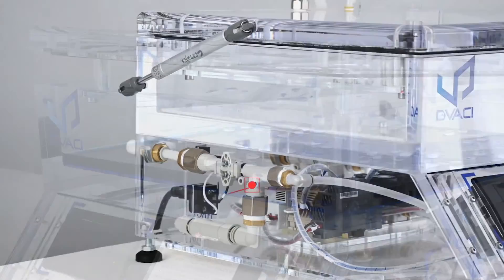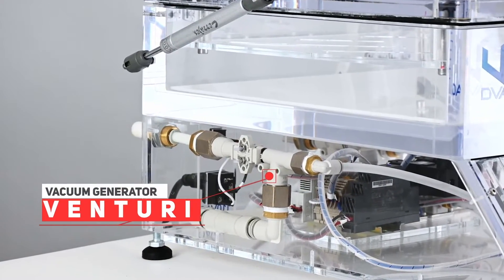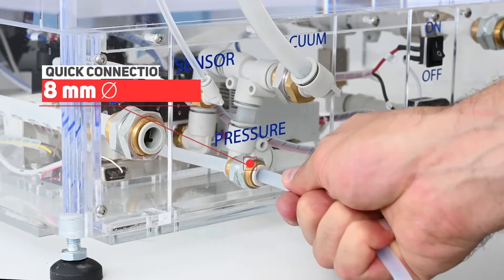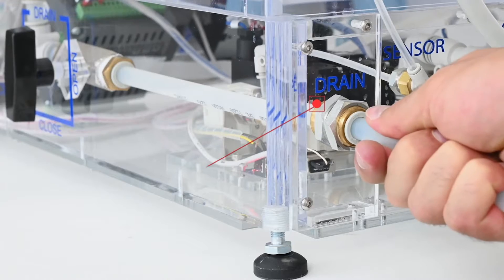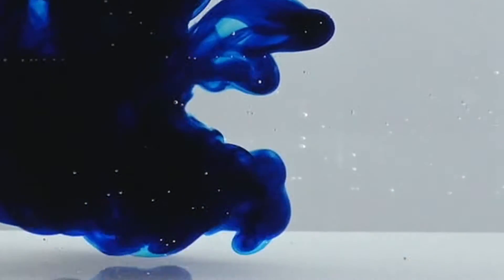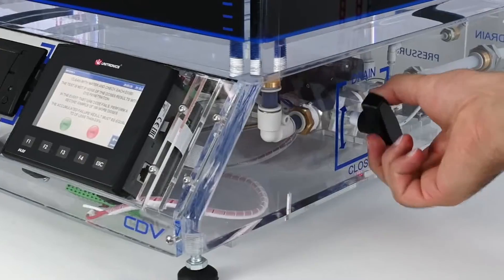The vacuum is generated through an integrated Venturi system which requires a compressed air supply to operate. The draining system will allow you to purge the chamber and this way it is possible to recover or dispose of the dye without splashing or staining the operator.